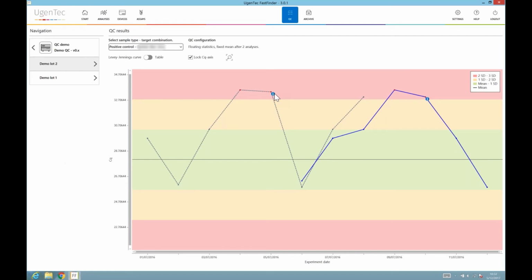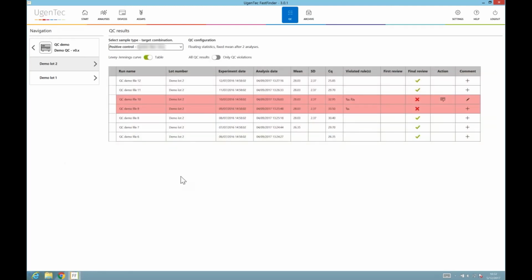This can take time, and of course it means that there's a time lag from actually when you're doing this analysis to when you are actually getting the quality control data. What we do is, of course, build this into the software so that it is output to the user in real time, so that there's no delay between an outlying batch being discovered and being able to react to this in a quality controlled manner.